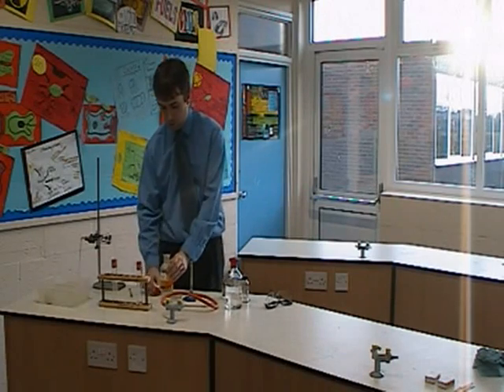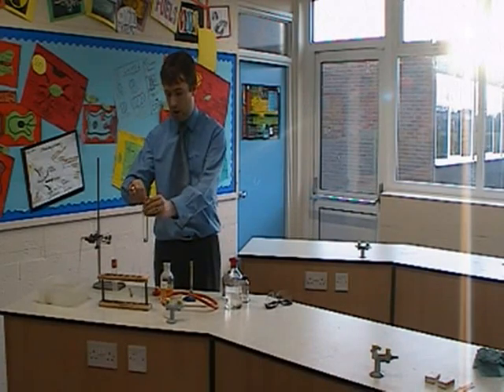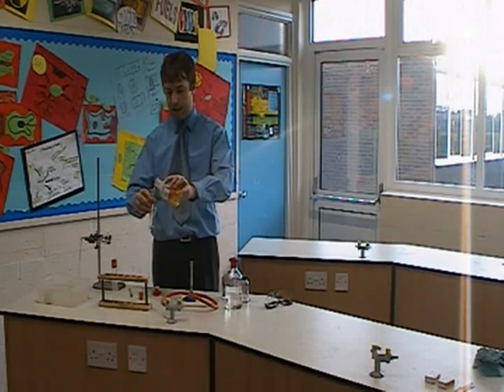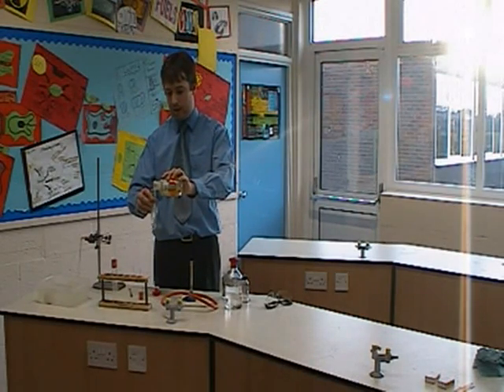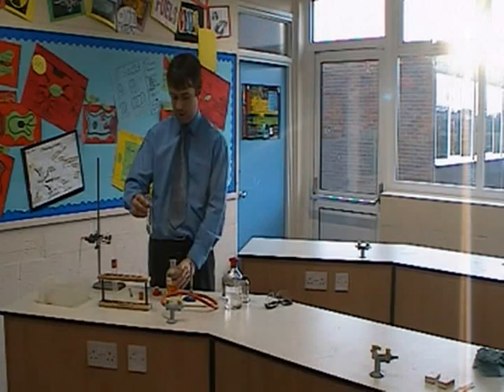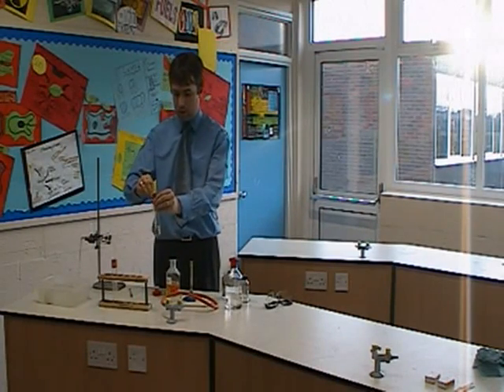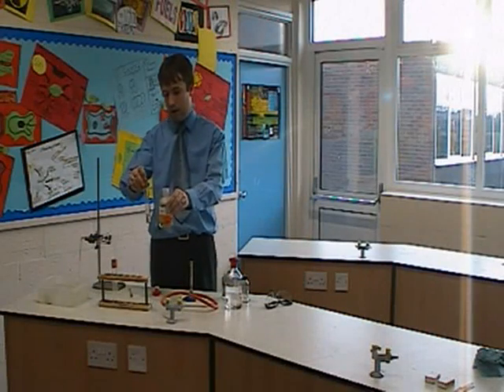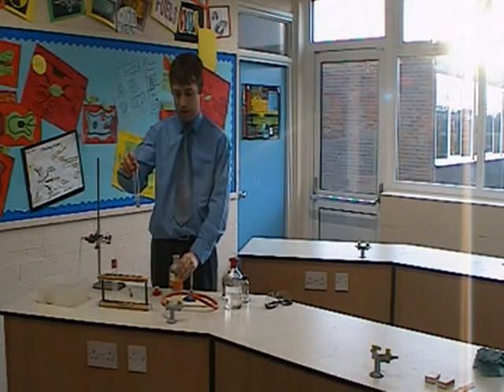If I pour some of that bromine water into a boiling tube containing paraffin as an alkane, the liquid will stay a yellowy colour. If I put the bung on and give it a shake, the liquid stays a similar colour to what the bromine water was in the first place.